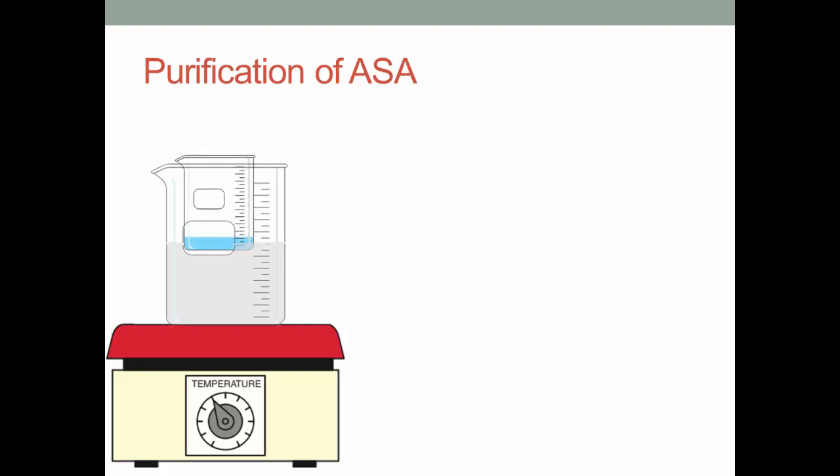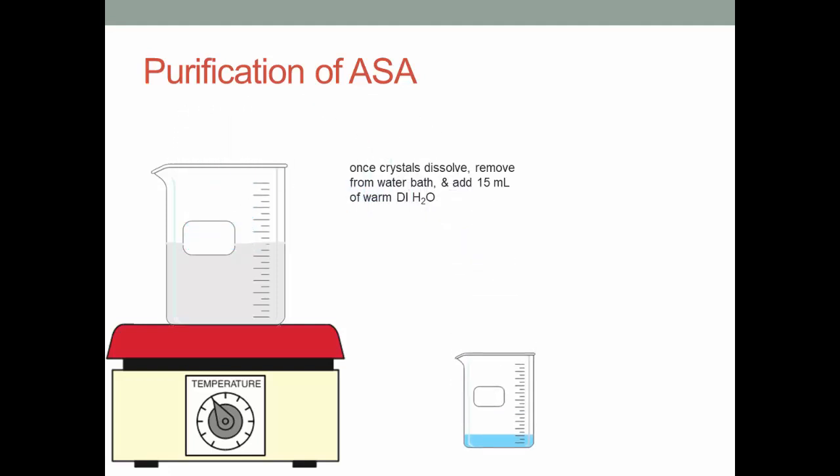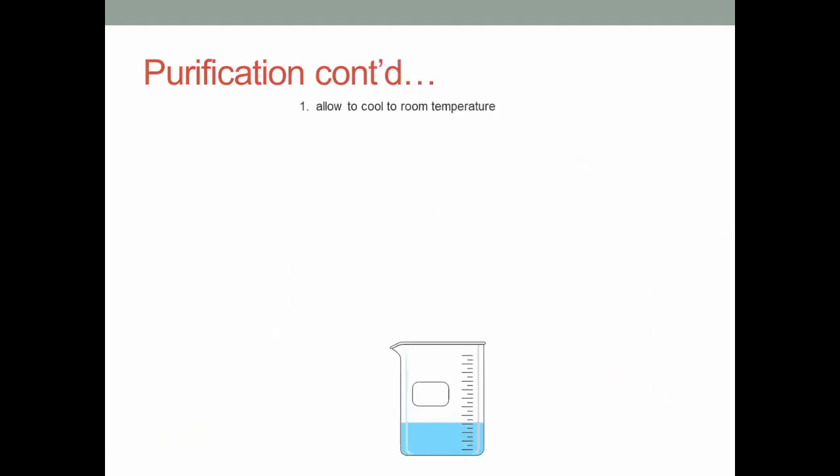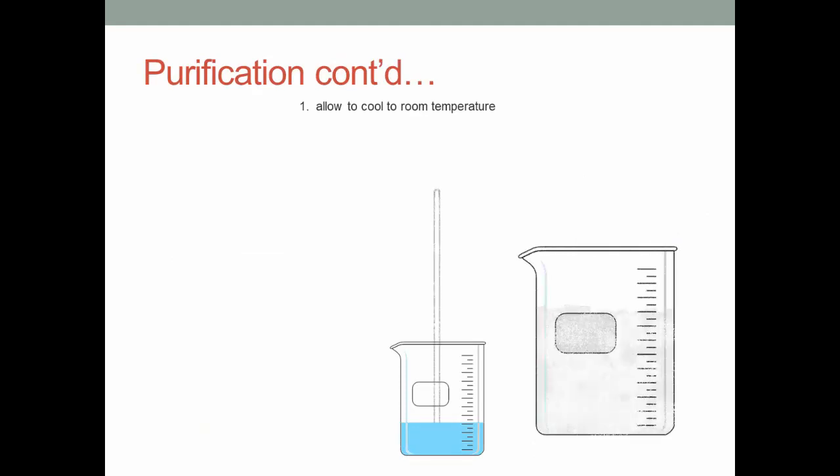Once all the ASA crystals have dissolved, take the beaker from the water bath and add 15 ml of warm, deionized water. Allow the solution to cool to room temperature. Scratch the beaker using a glass stirring rod to help with crystal formation.